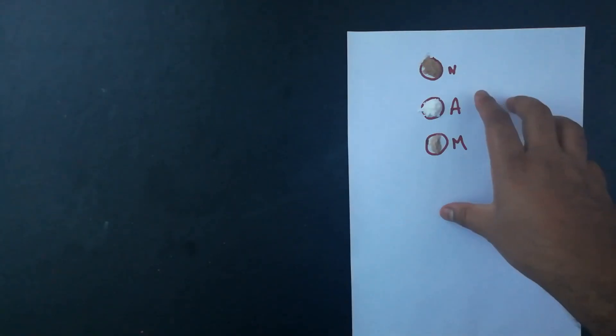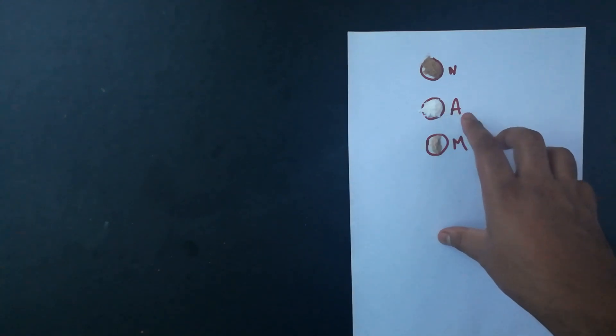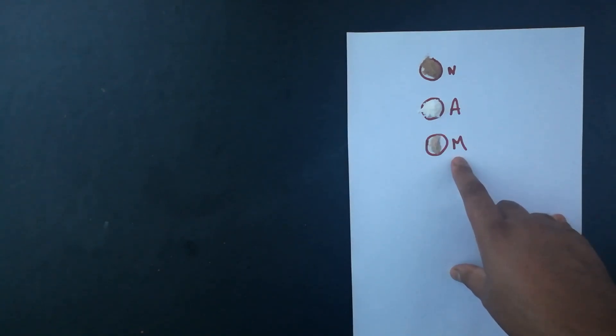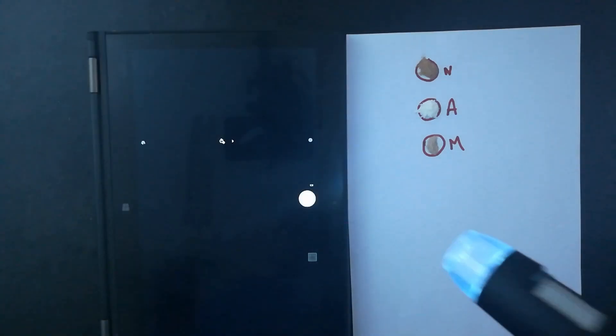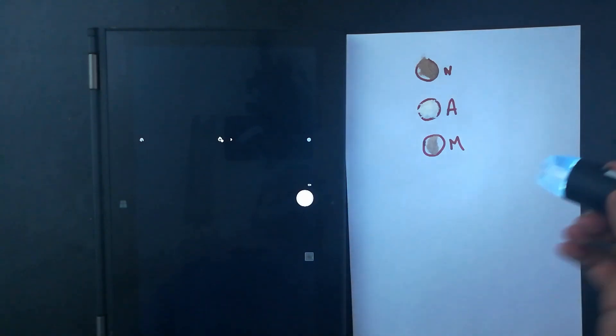Alright, so just for understanding, first one I'm repeating is Nutrimed. It's 70% protein. Then we have As It Is Nutrition, which is like whey isolate and raw. There's no additive, no enzyme, nothing. So it's the purest form. And then we have the Muscle Blaze Beginner's Whey, which is like 50% protein. Now let's put these things under this USB microscope.